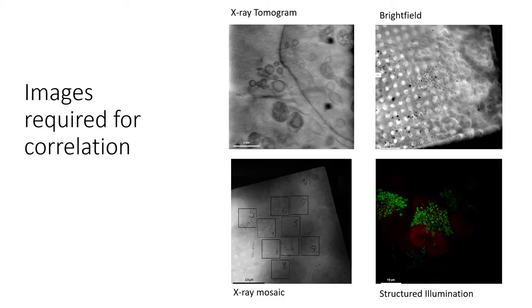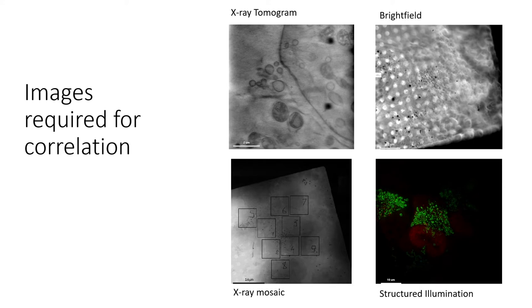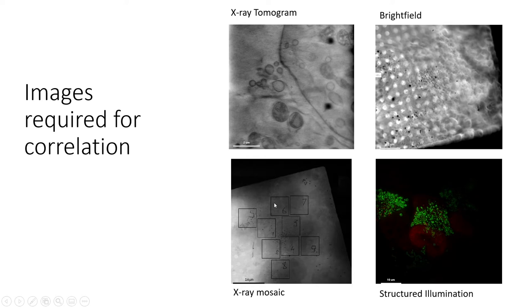These are the image datasets that you'll need. It's helpful to have these four images in one folder when you do the correlation because it also generates lots of other files. You'll have the 3D x-ray tomogram that's been reconstructed and also a 2D x-ray mosaic image. It helps if it's annotated as well so you can find the exact area that you've imaged in the tomogram.